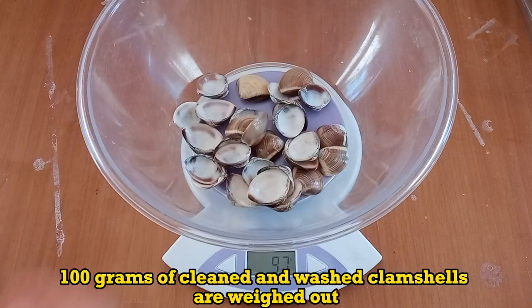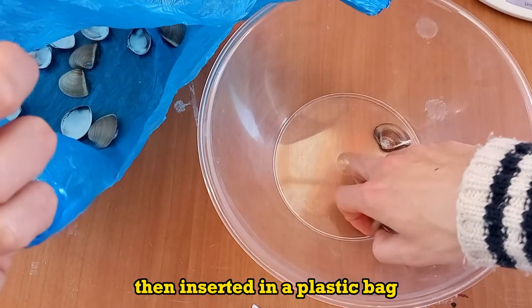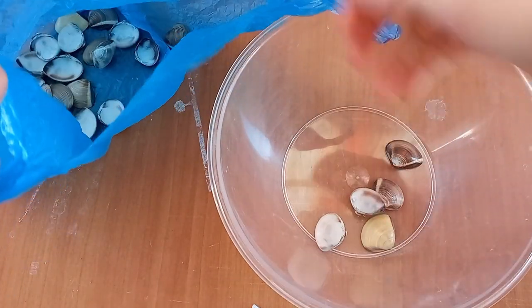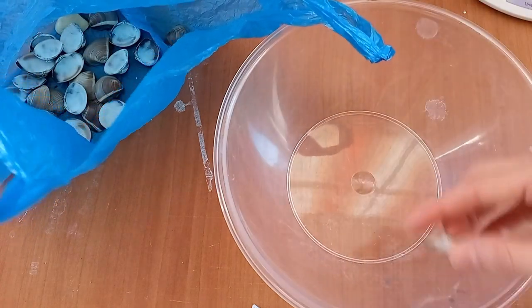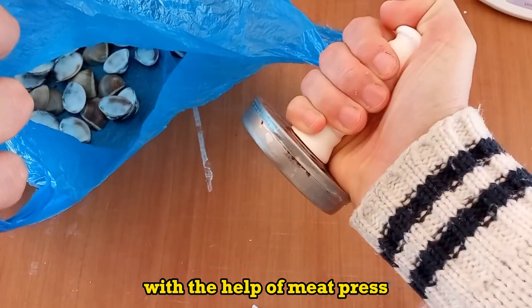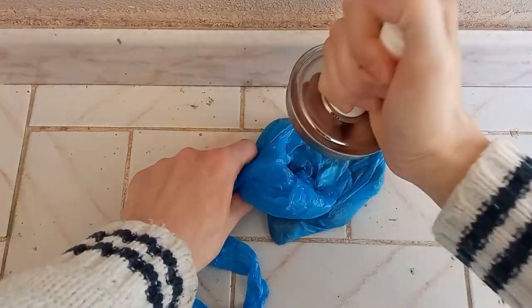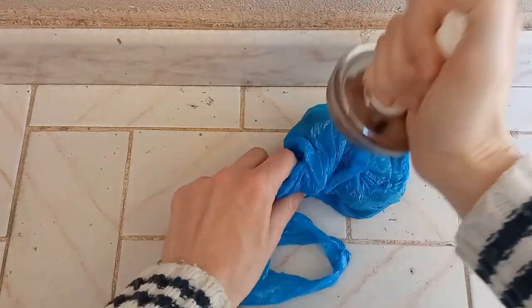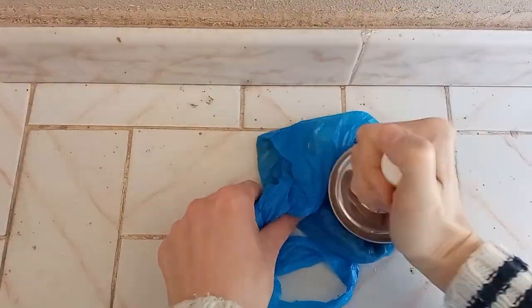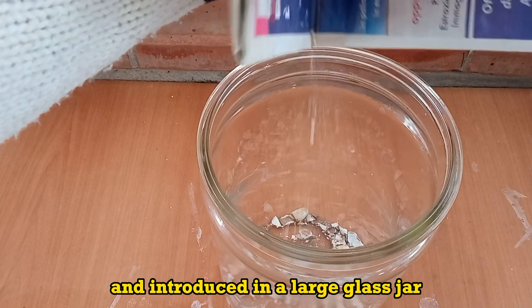100 grams of cleaned and washed clamshells are weighed out, then inserted in a plastic bag. With the help of a meat press, shells are crushed in pieces and introduced in a large glass jar.